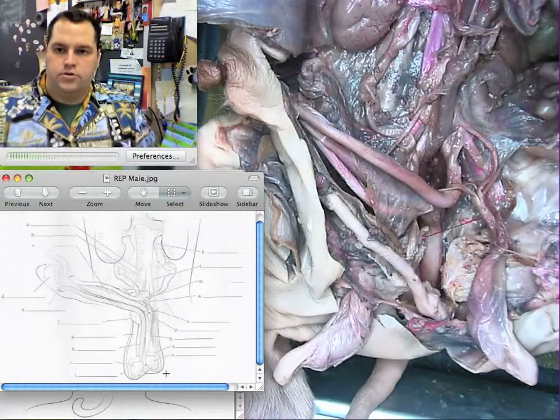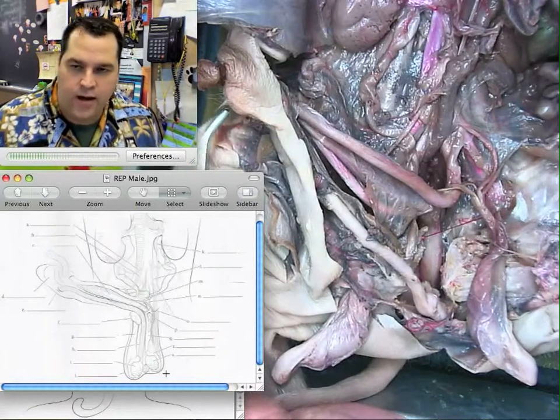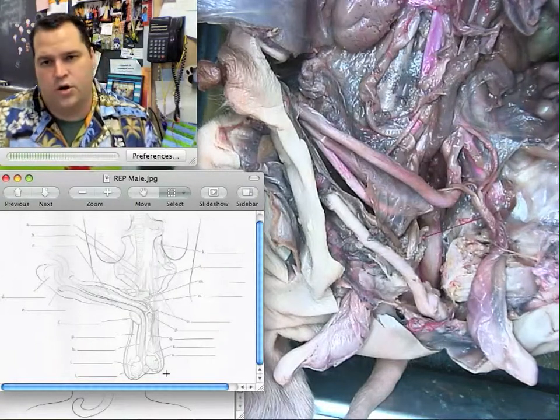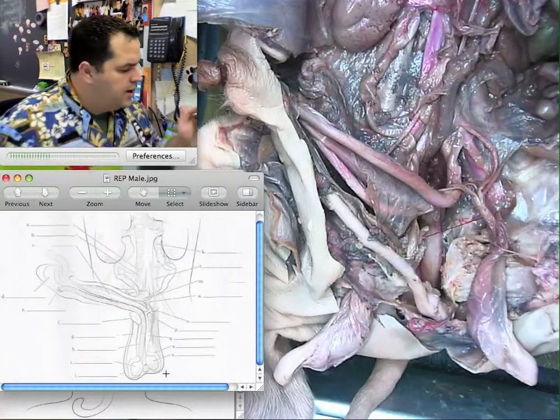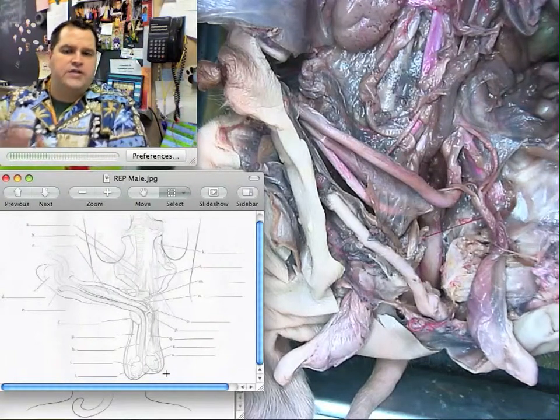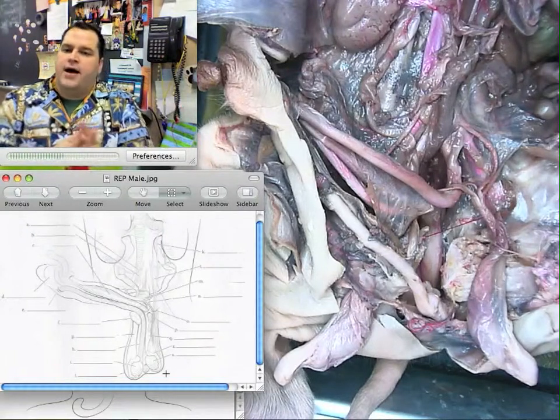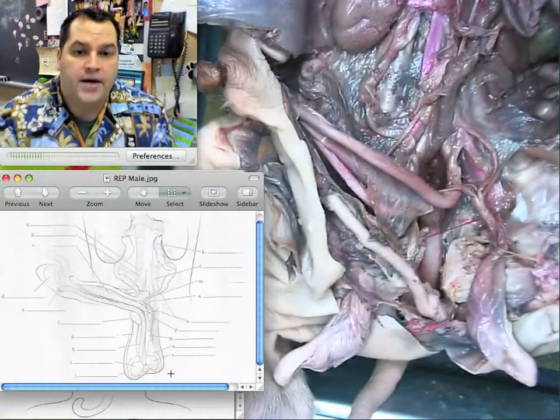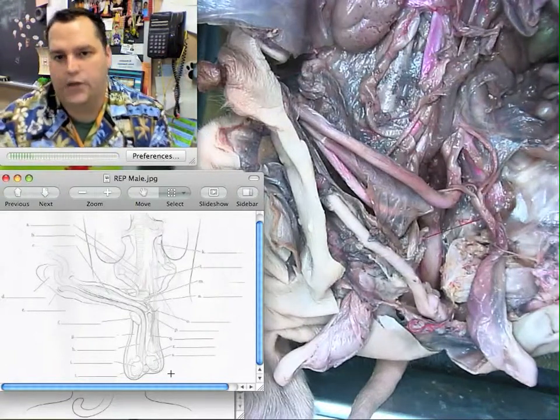One quick note: to determine the gender of the pig is actually quite simple. The urogenital opening of the male pig is right below the umbilical cord. The urogenital opening in the female is all the way back, just ventral to the anus. That's very easy to tell the difference if you know what you're looking for. The urinary systems work very similarly even though anatomically they have different reference points, so you don't need to learn a separate urinary system for male and female. It helps to understand the reproductive structures in context with the urinary structures because they are so intimately related.